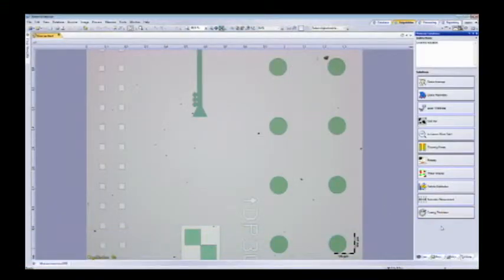Some of the features in the software: we have material solutions in the Stream software. These solutions are packaged and individualized for certain custom uses in the field. For industrial applications, we have grain analysis for metals and cross sections, where they want to measure grain boundaries, grain patterns and widths. We have layer thickness measurements for cross sections of materials where they have layers that they want to measure. We have metal inclusions; certain manufacturers of different types of metals want to measure their inclusions. All of these, including porosity measurements, are solution modules designed specifically for an application.